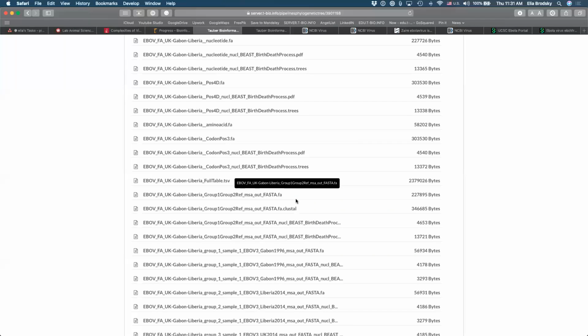So what I want to do is go through these different steps and cover a few more slides so that we are more ready to actually practice this next time when we have a full session dedicated to just running the pipeline. Okay, Claudia, so I'm going to try and complete the presentation today so that next time we can do a review and do a more slower step-by-step process, because as you will see, our next session is dedicated to selecting the files and actually running the pipeline.